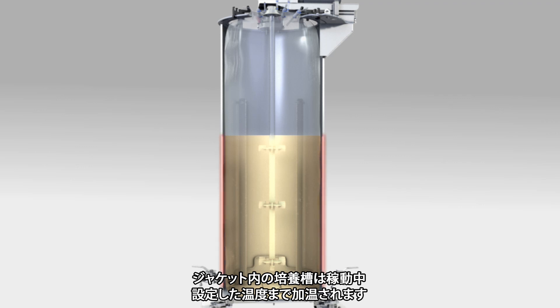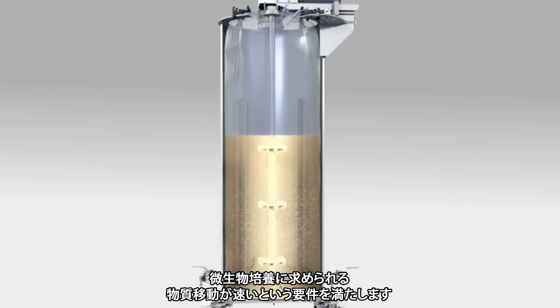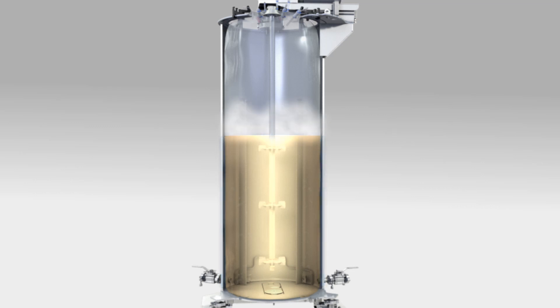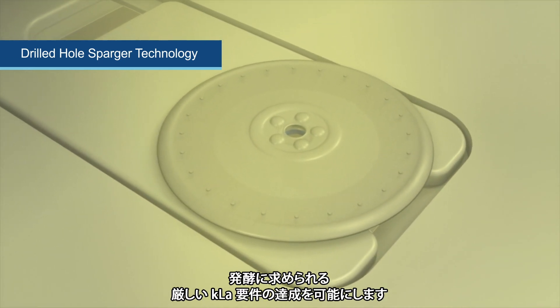During operation, the jacketed vessel heats up to the desired temperature. The combination of the three Rushton impellers and the four external baffles guarantees a uniform mixture and meets the high mass transfer demands of microbial culture. Microbial fermentation has unique requirements such as powerful agitation and efficient cooling.